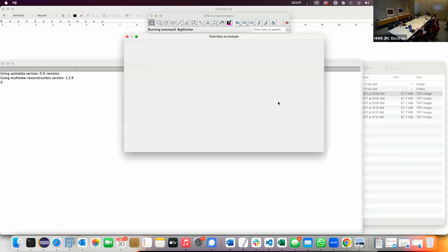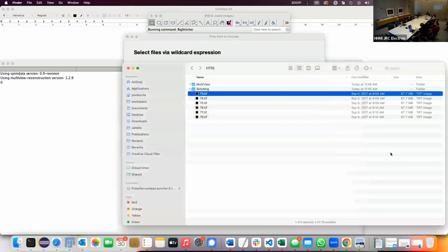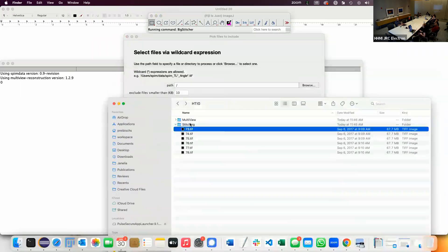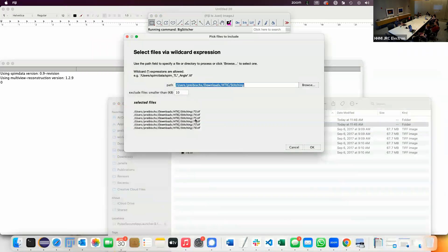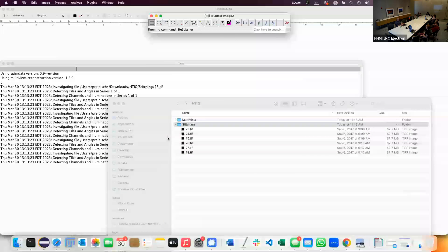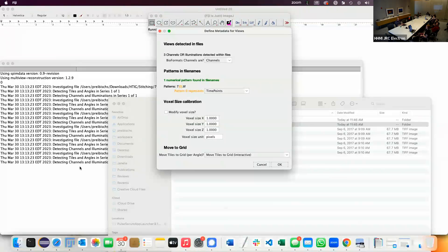Please interrupt me if something is unclear. So then you drag and drop the directory or files in here — it tells you which files it found. You can do wildcards and so on. You can exclude small files; often you have things like .DS_Store on Mac and Windows and it won't look at those. Then it will automatically go through these files reading the metadata.